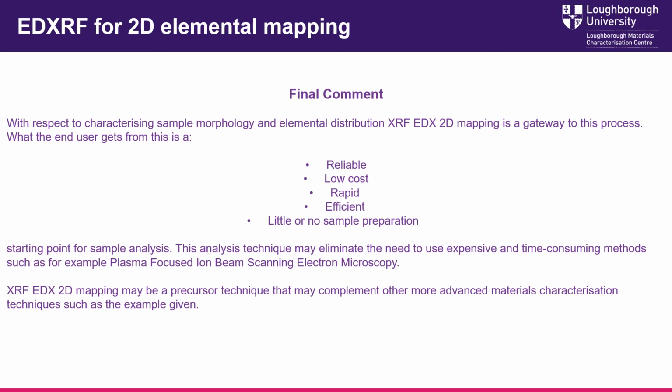XRF EDX 2D mapping may be a precursor technique that may complement other more advanced material characterization techniques, such as the example given.